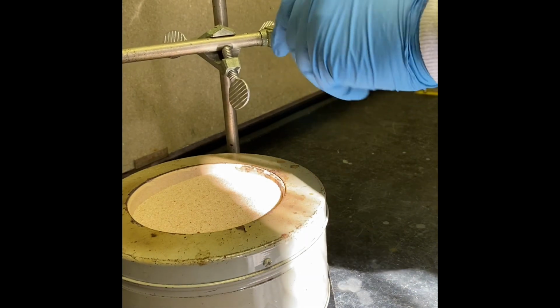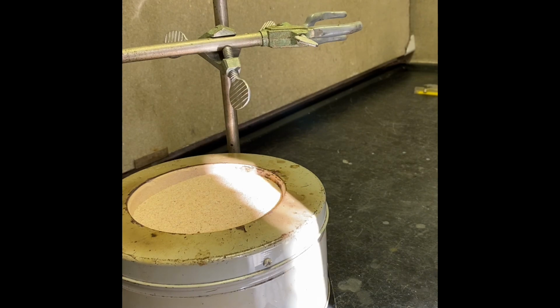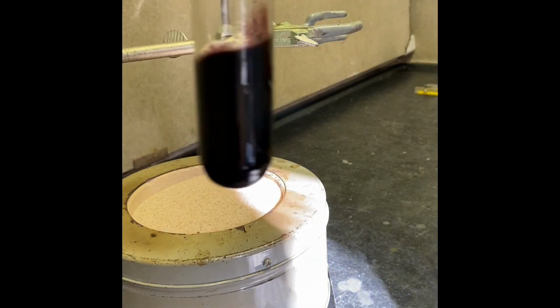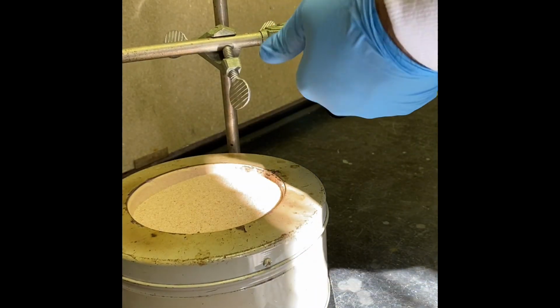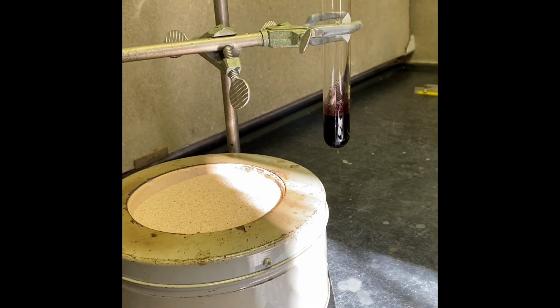So I wanna rinse down if any compound stuck on the side of the test tube, so kind of washing down with the solvent, and as you see it's a dark color, so I'm gonna put that back, clamp. And what else I need 1 milliliter of our second reagent.